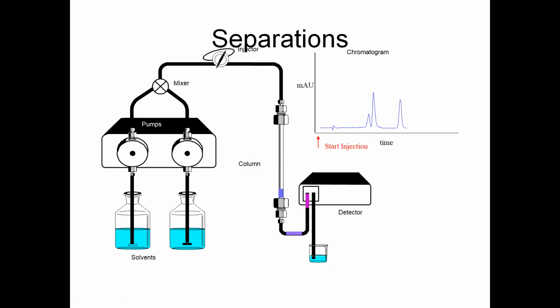Now you see the third compound is going to the detector, and the third peak is coming after a huge difference. The RT difference between this and this is very high, and the RT difference between this and this is very low. That means these compounds are having similar structures or similar polarity, but this compound is having different polarity, right?